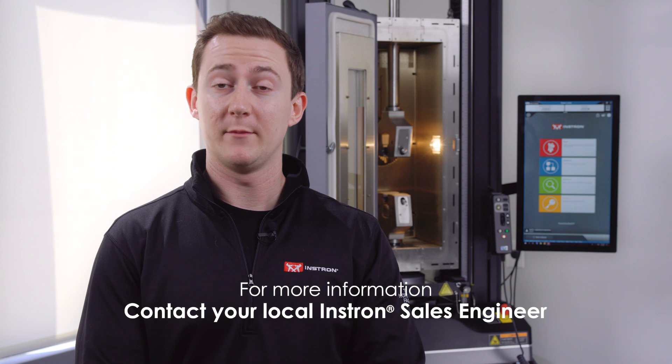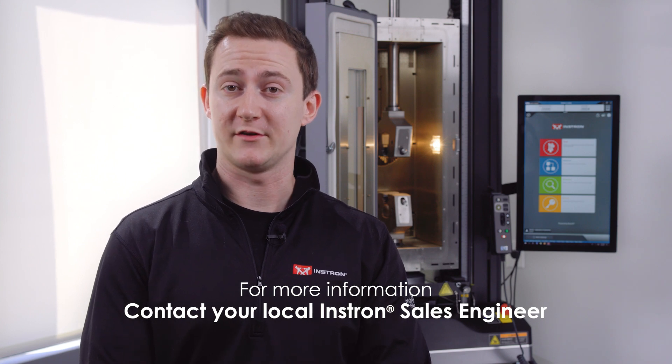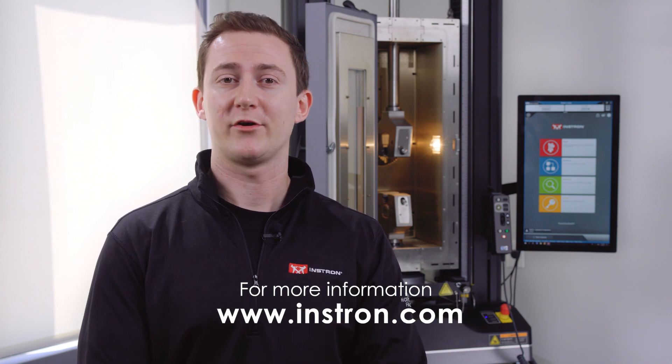And that's a high-level look at our environmental chambers. For more information, please contact your local Instron sales engineer or contact us at instron.com. Thank you.